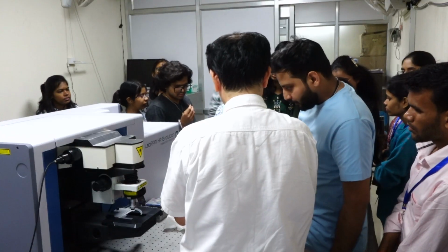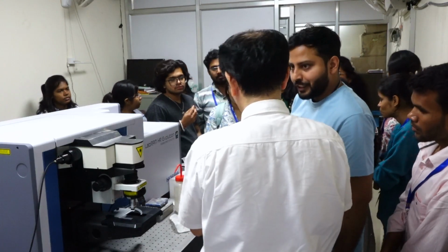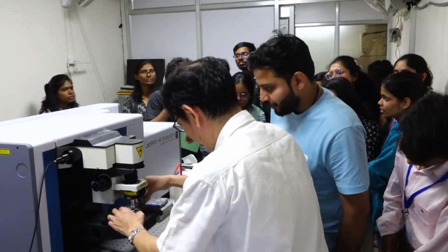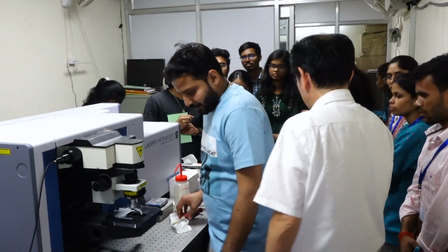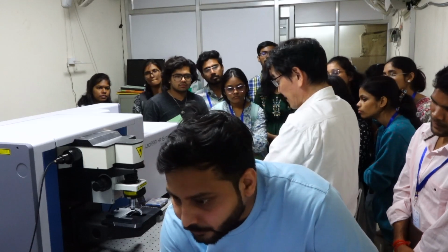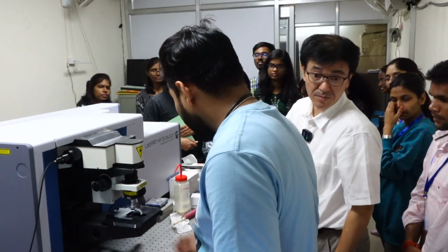Okay, generally measure this part. So I don't know how to do it with this. So, okay, just placing the sample here. Irrespective of the sample preparation or setting, we put it on the microscope stage. Then we will see where the sample is by checking a physical image.